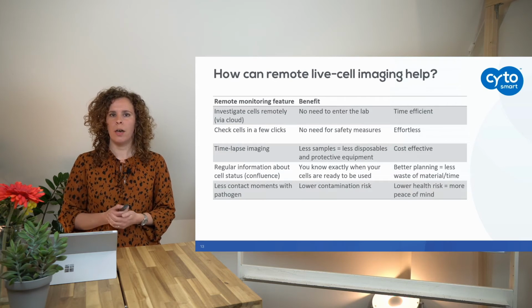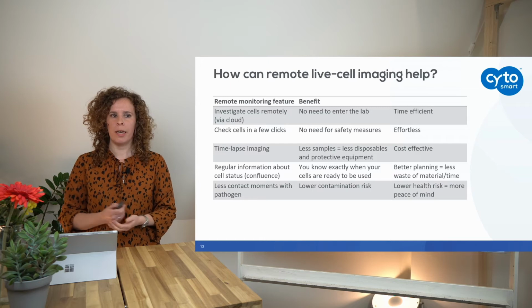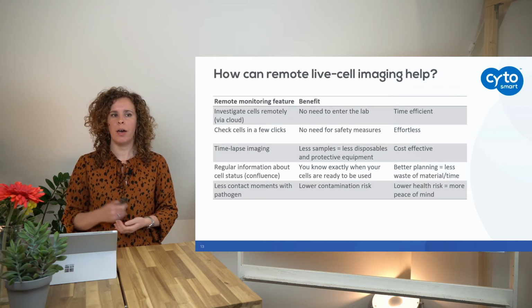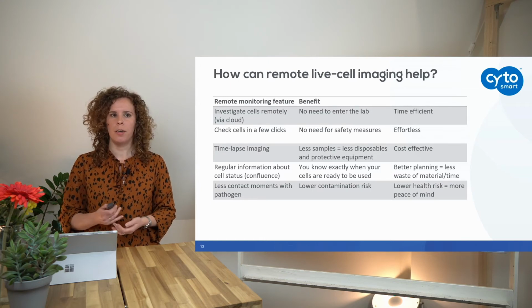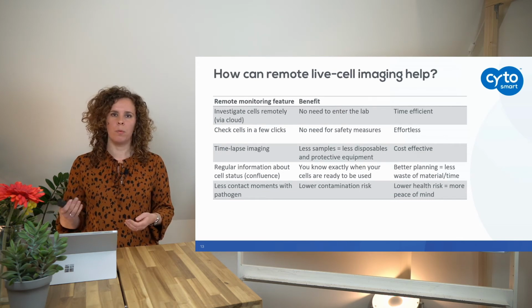Next to this, you also have fewer contact moments with the pathogen. And when you have fewer contact moments, you have a lower risk of contamination, so a lower risk of getting ill, which gives the people more peace of mind.